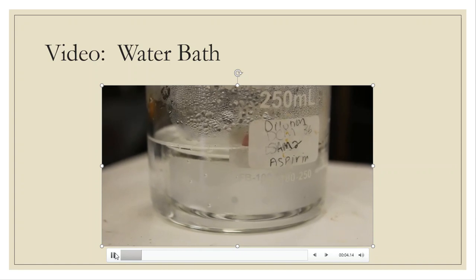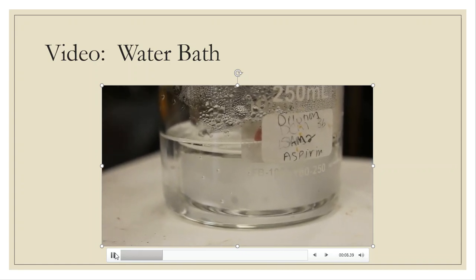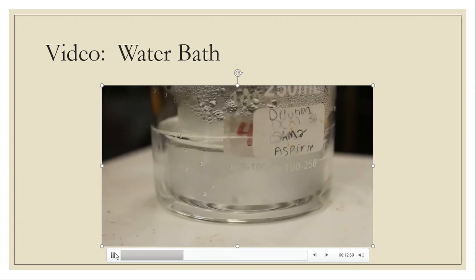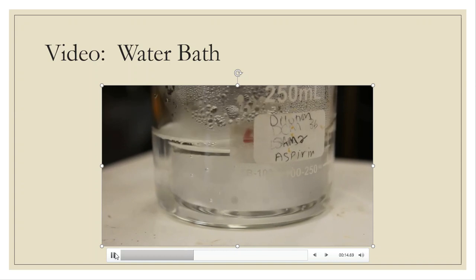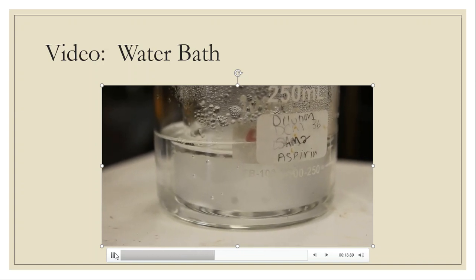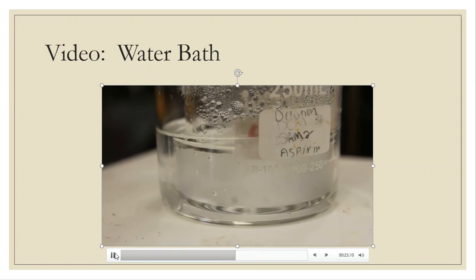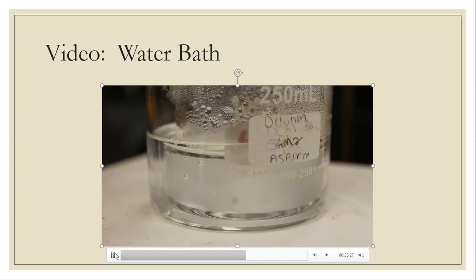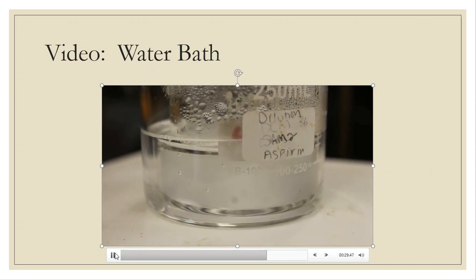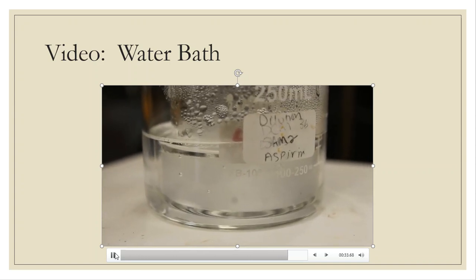Okay, so what you're seeing here is a boiling water bath. One of the reasons it tells me a boiling water bath is because water doesn't boil greater than 100. So this helps ensure that I do not add too much heat to this clathrate that's getting dissolved on me. So that's what you're seeing in the larger beaker. You see a level of water, and that's getting heated up, and it's at the point of boiling at this point, and it's helping dissolve those crystals on the inside beaker that I have just sitting in the boiling water bath.